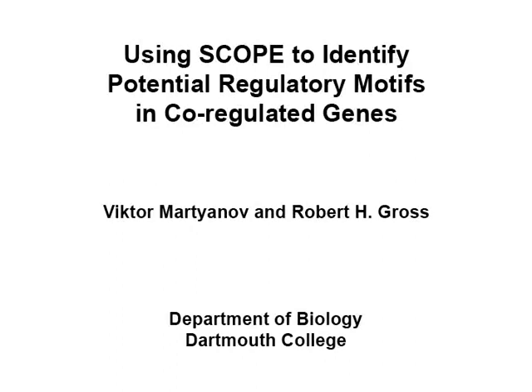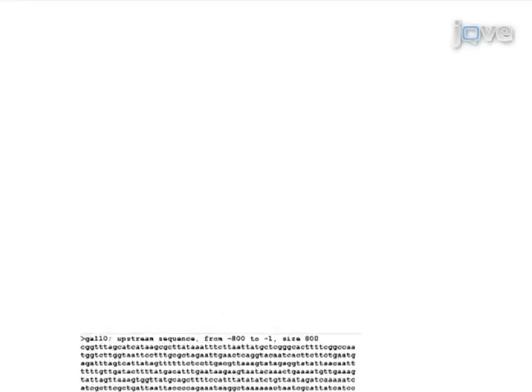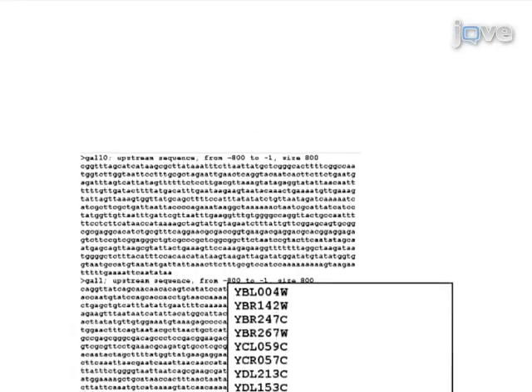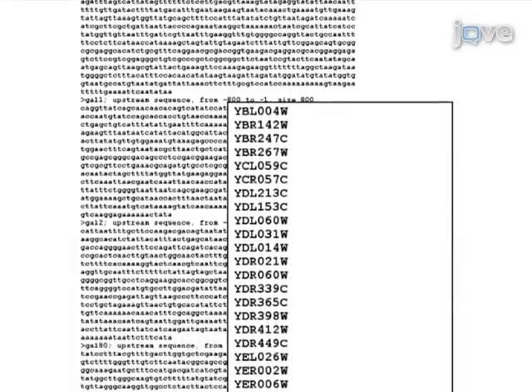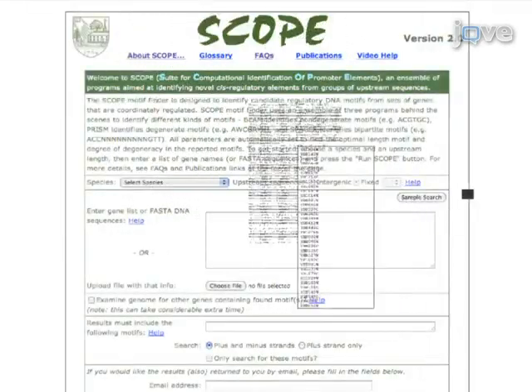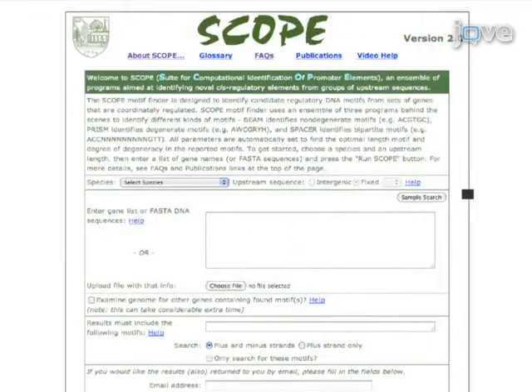The overall goal of the following experiment is to identify potential regulatory signals in sets of co-regulated genes, and to identify other genes that might functionally belong to this set. This is achieved by submitting a list of candidate genes or sequences to the SCOPE algorithm.